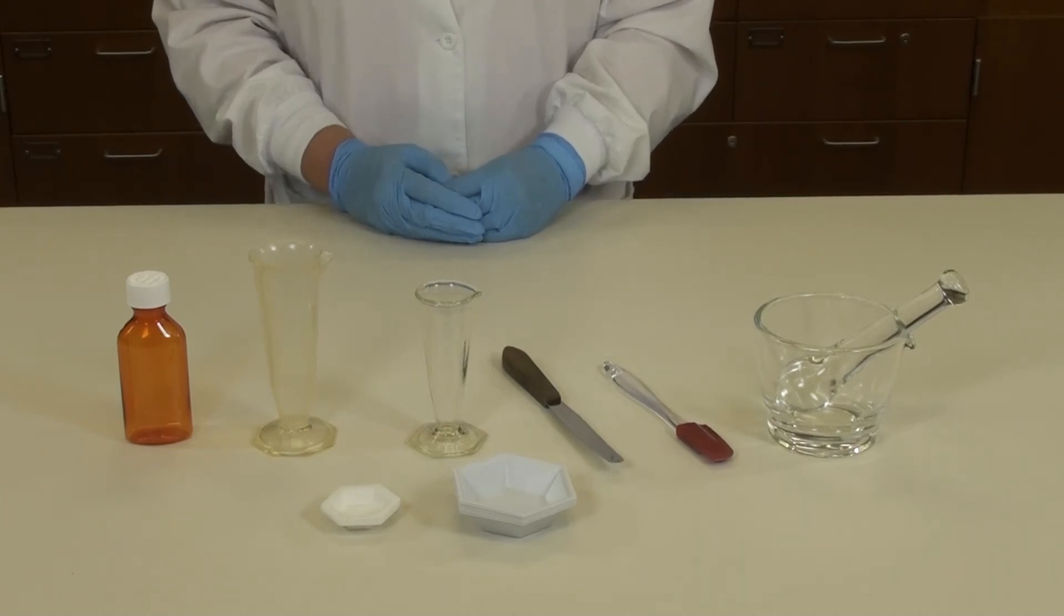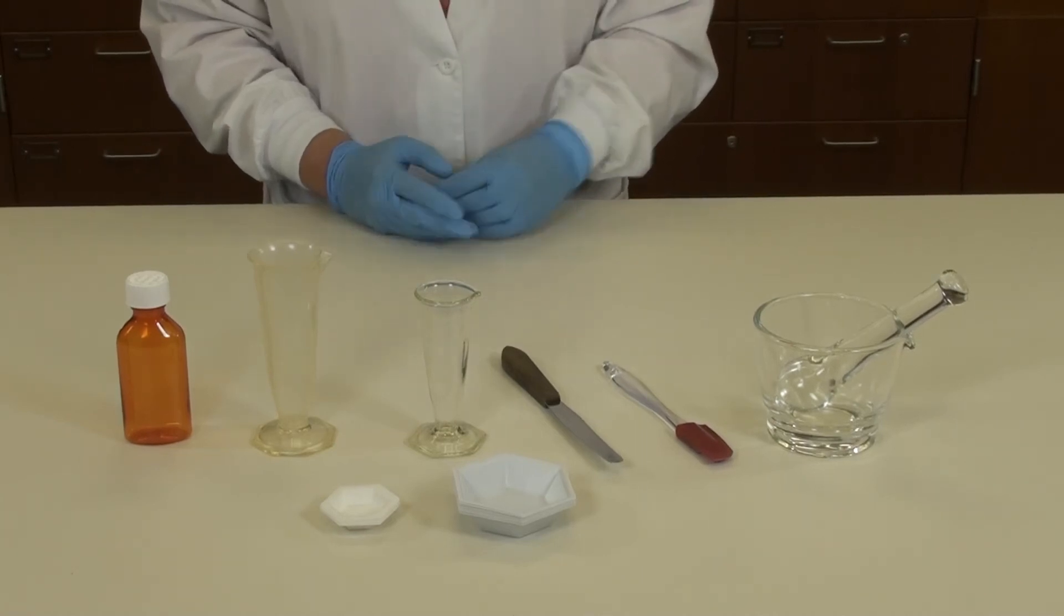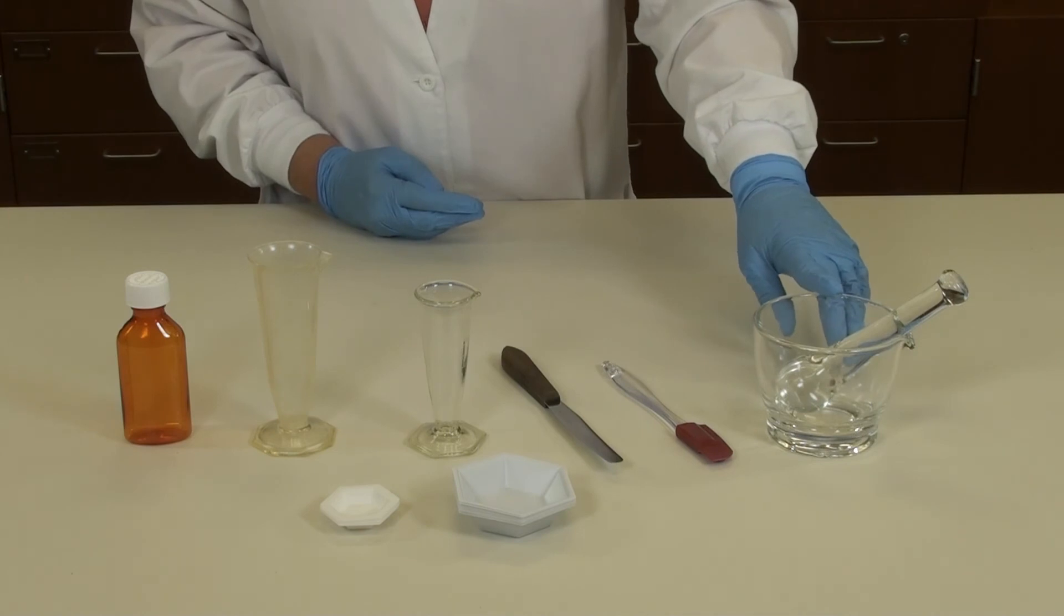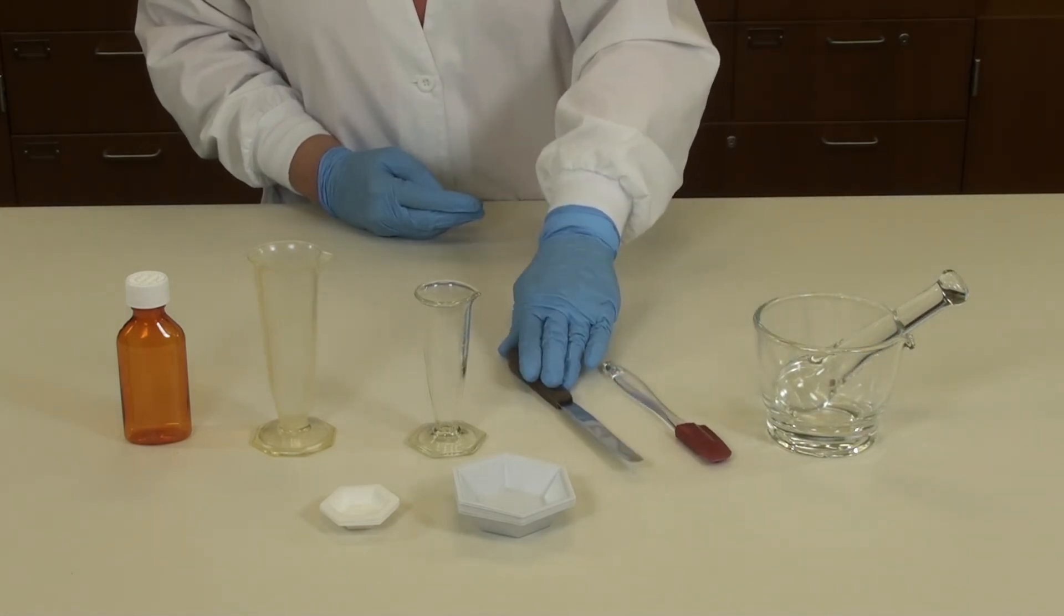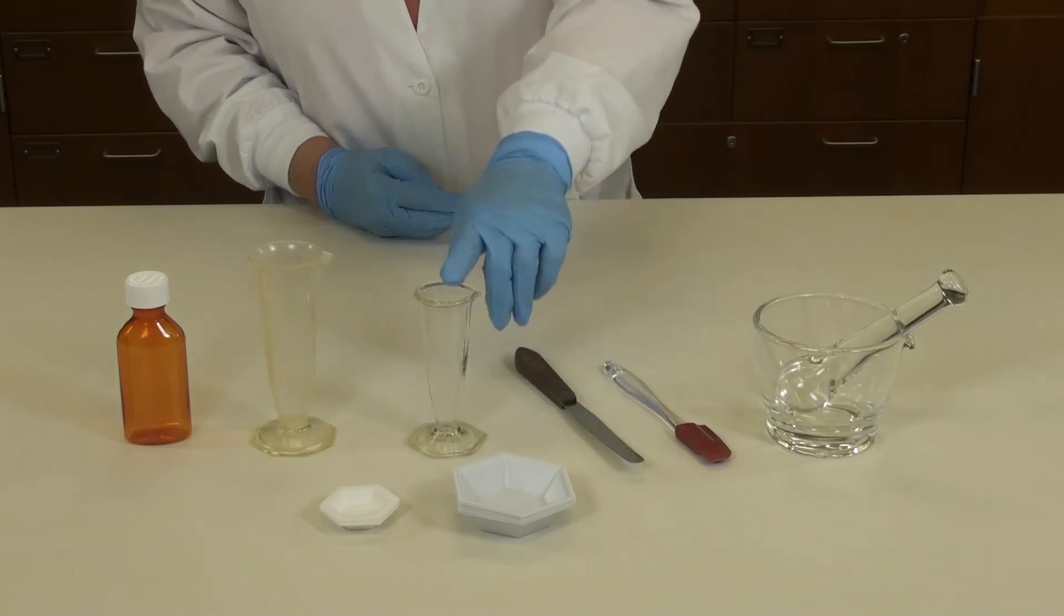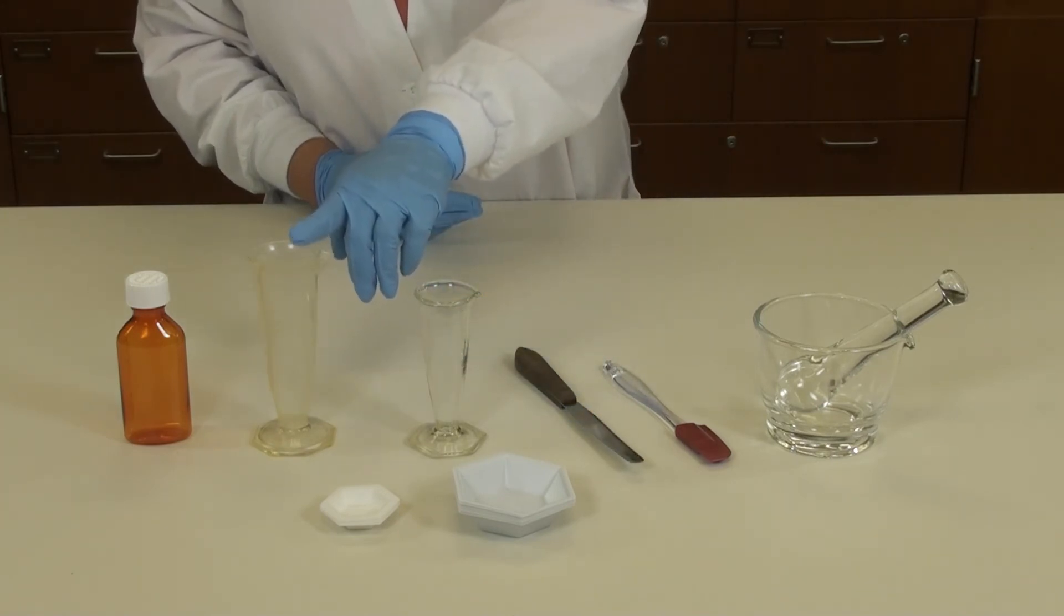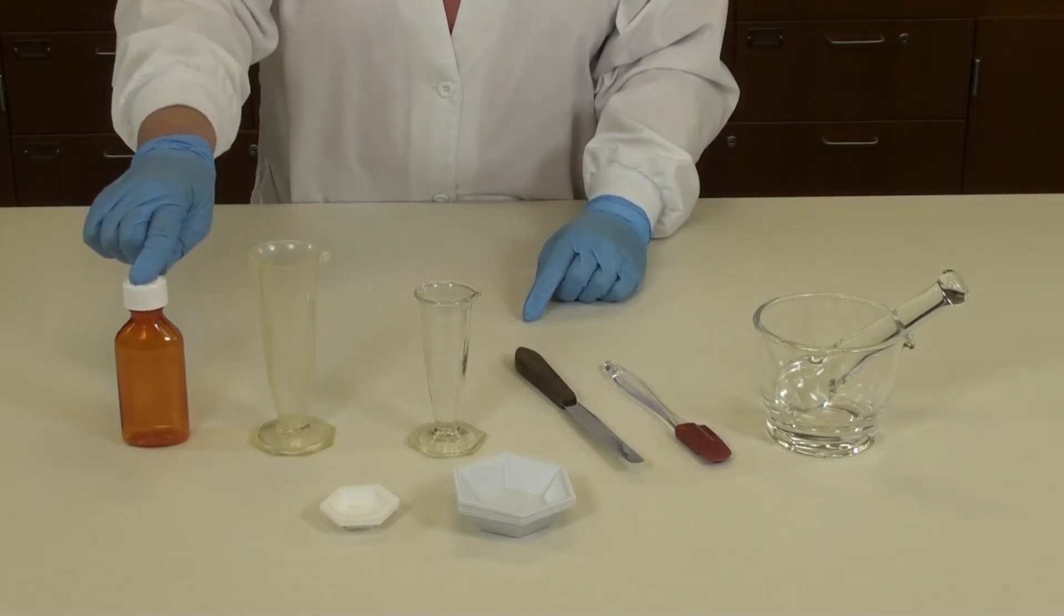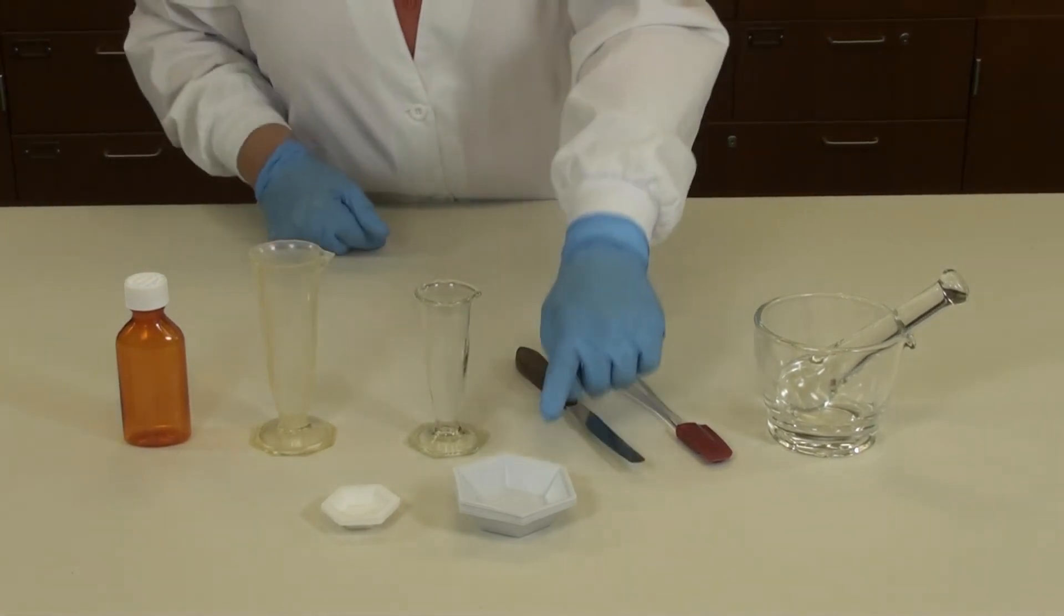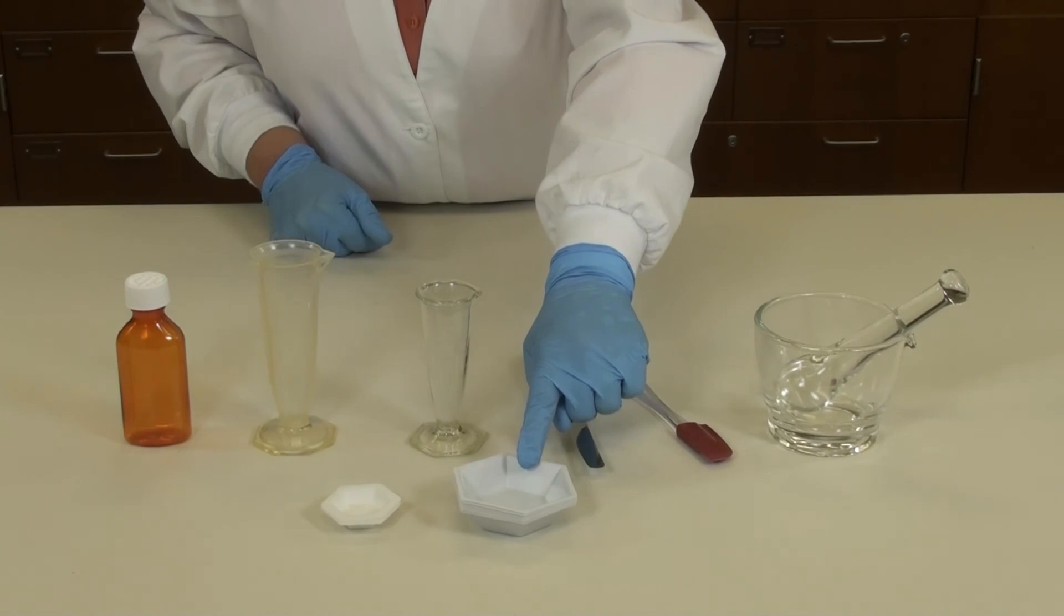The required equipment for suspensions will be a glass mortar and pestle, a rubber spatula, a small metal spatula, a 2 or 4 ounce graduated conical, a 3 ounce oval prescription bottle, and weigh boats, both medium and small.